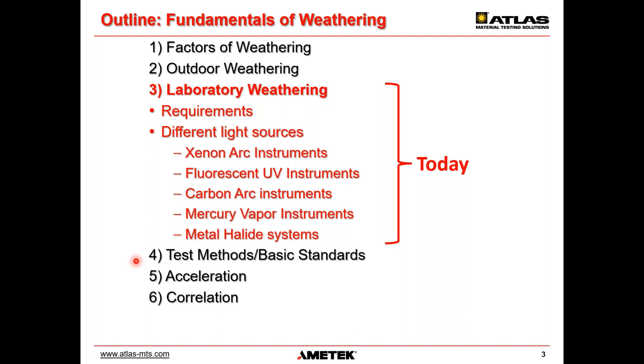And when you have seen all these fundamental first details, we show you test methods and the basic standards which are commonly used in weathering testing, outdoor and indoor. We give you deeper knowledge about acceleration in part five. And then finally, we show you how to determine correlation using common statistical tools, which are quite useful.